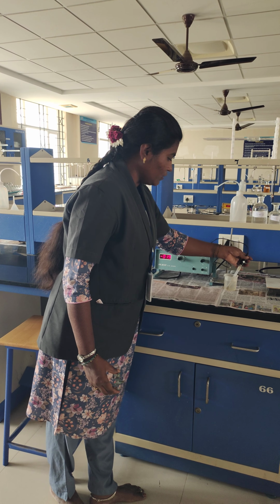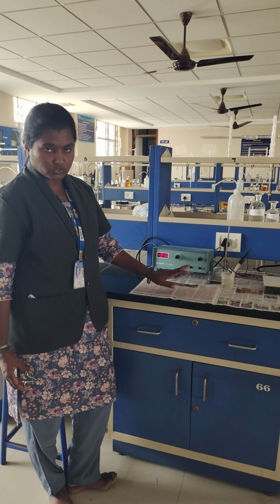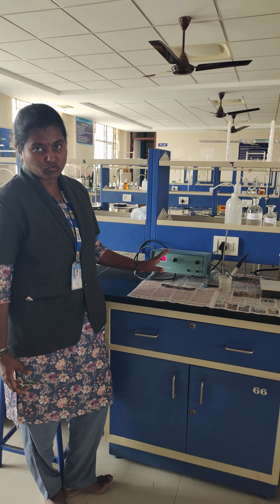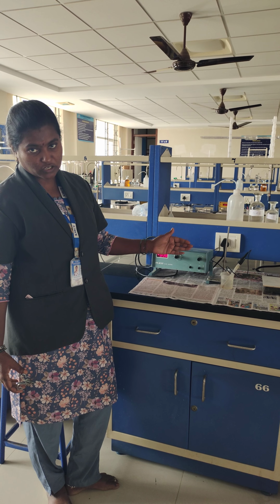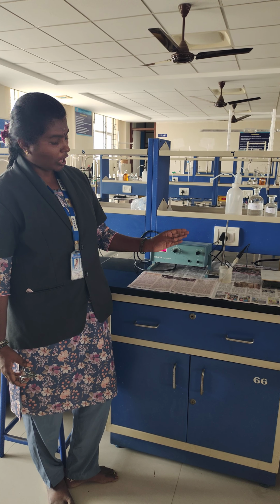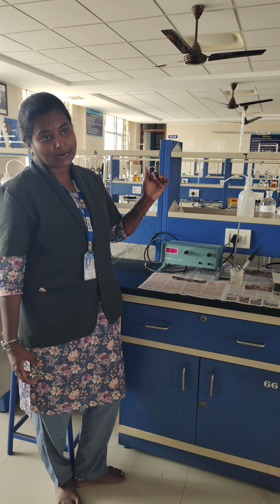While we are dipping the glass electrode in this acidic solution, the meter will show the respective pH value. If you continuously add the sodium hydroxide from the burette, for each addition the pH measurement will increase. After reaching its saturation point, there will be a sudden increase.